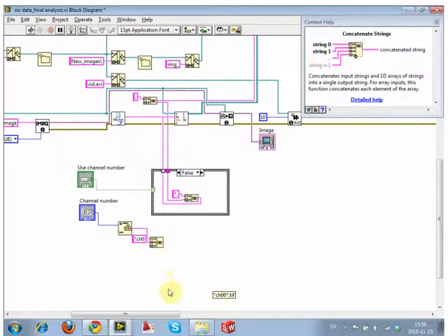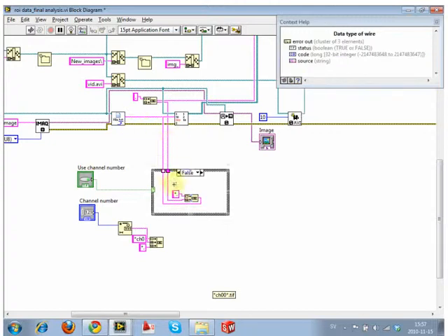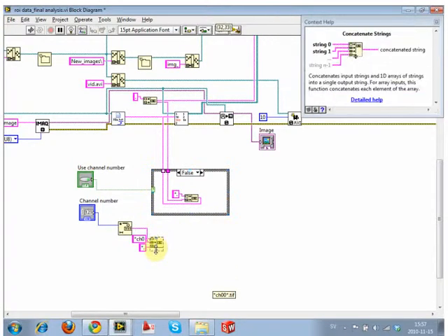We're just creating a new bit of text. Okay, once that's done, we can feed that into something like this, which is reading this file extension. So we've now built this string structure. Can we do, yeah, we can do it all outside, in fact. So let's keep making it bigger. This one is the file extension.